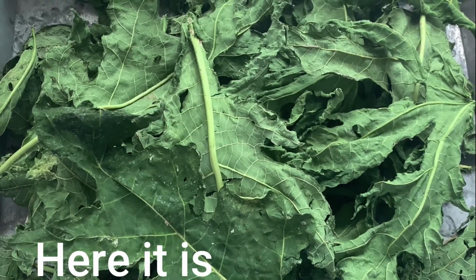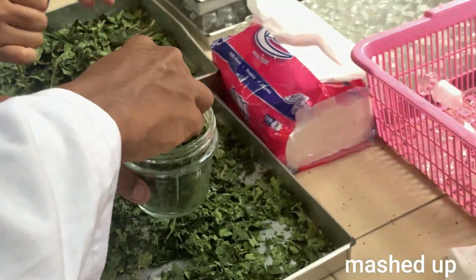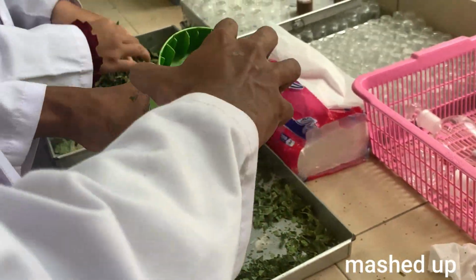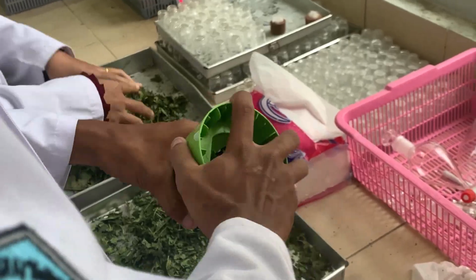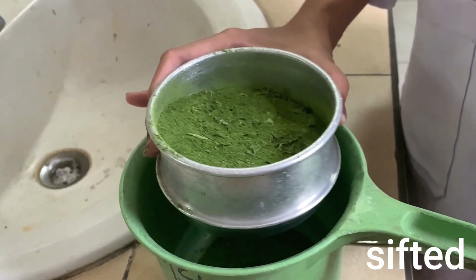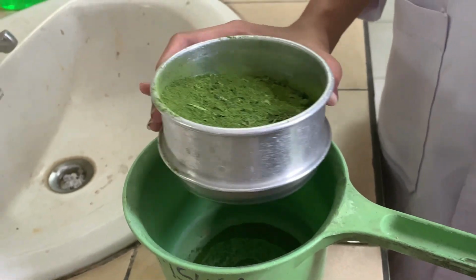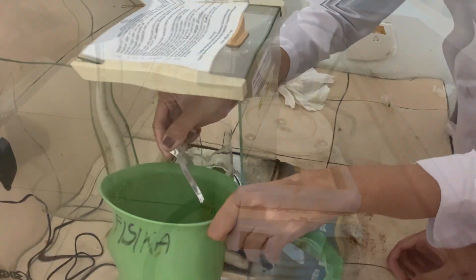And then remove the papaya leaf sample from the oven. Crush the dried papaya leaf using a blender. And then sieve with a 60 mesh sieve so that the powder has a uniform size and has a large surface area in order to obtain maximum result when macerating.